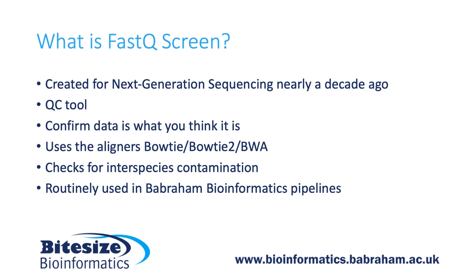For example, if you are working with human samples and somebody else in your lab is working with yeast samples, it would be a good idea to use FastQ Screen to check that no yeast DNA is present in your datasets. Over the years, we have found FastQ Screen to be an invaluable tool to check that samples do indeed contain what they're supposed to.